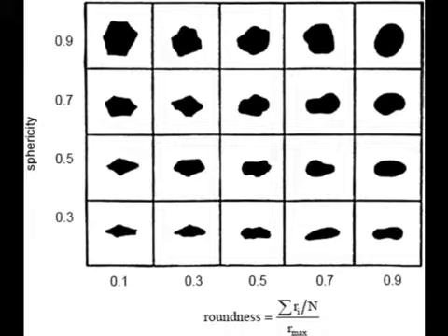And the way that you can determine roundness and sphericity is kind of old school. Got to go back in time, 1963. A couple soil scientists, Krumbein and Sloss, developed this chart. And here's the chart right here up on the screen. This chart is still used today. And what we do is estimate how round and spherical the sand particles are.